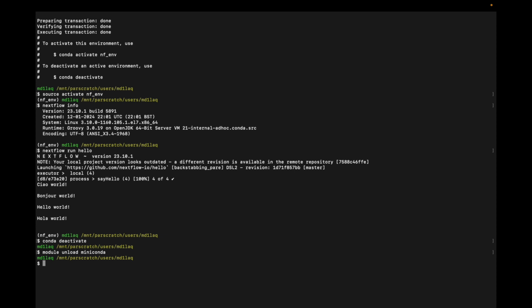So now that our Conda environment's created and we've checked that it's working, we can move on to set up our project folders. So this is a somewhat opinionated guide, i.e. it follows the system that I've developed. So we're going to use the same project directory hierarchy that I use for almost all of my projects. And to set this up, we can run a simple one-line bash command similar to those that you might have seen me run in previous tutorials.